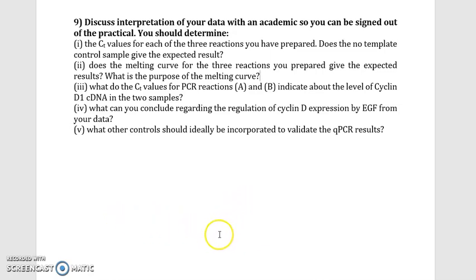And then when we reach the threshold, that's where we start to enter our exponential phase of growth, and that's where we get a huge increase in fluorescence, because the amplification enters the logarithmic stage of amplification. And again, when it plateaus, you'll see it later on the right hand side of the graph, it's going to plateau because perhaps some of the reagents have been used up. Alternatively, the Taq polymerase might just stop working. So there's always that.